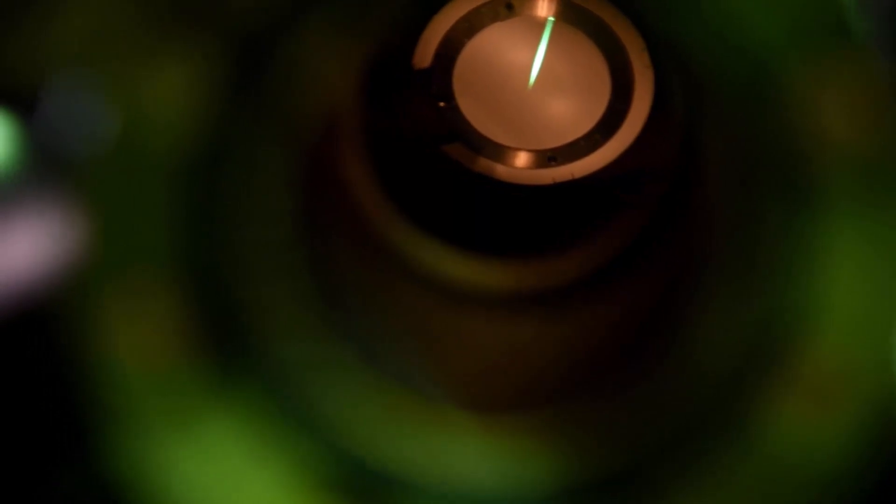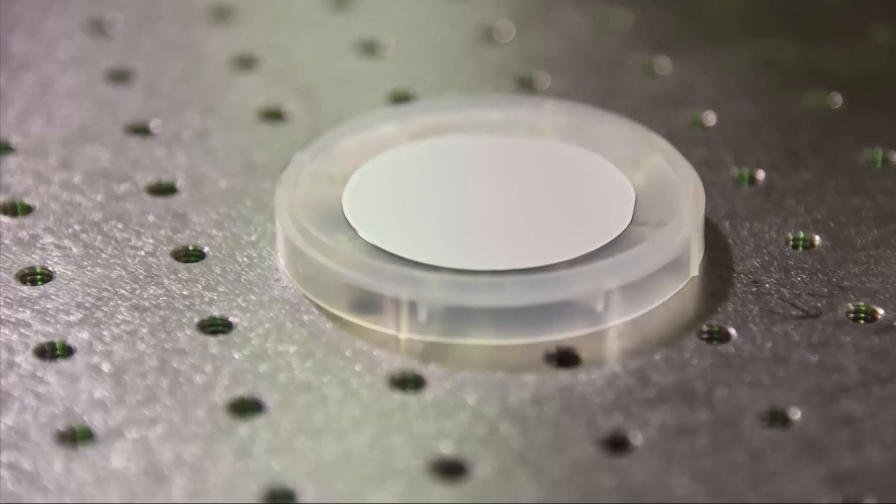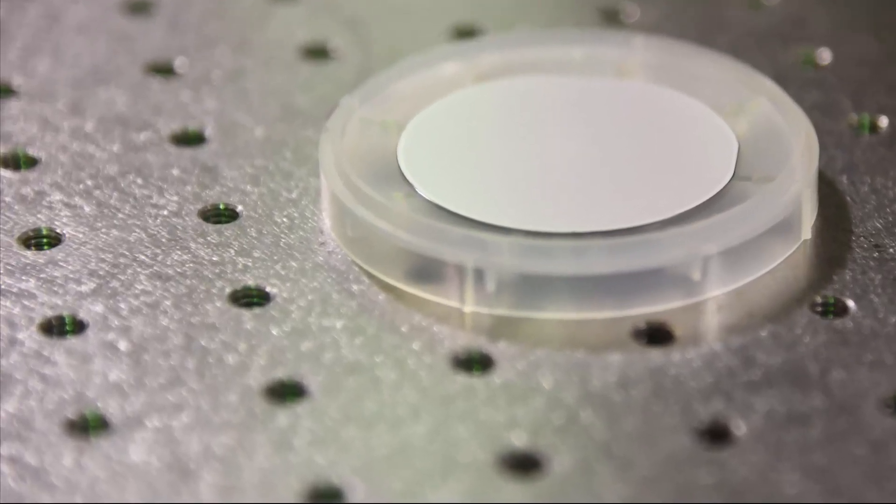At K-Space, we supply these substrates in 1, 2, 3, and 4 inch diameters. Contact us today about making your RHEED electron beam alignment easier.